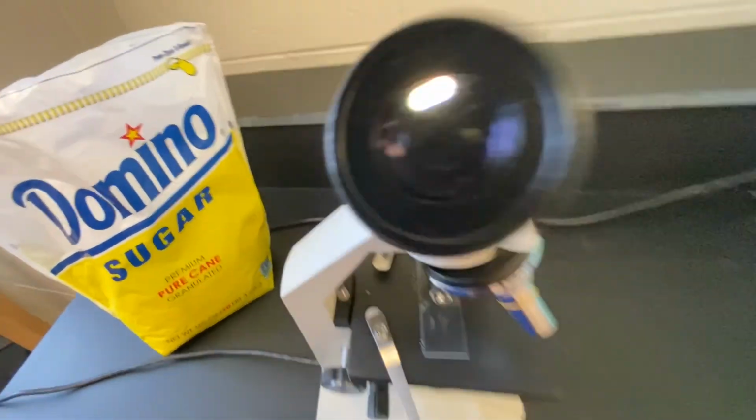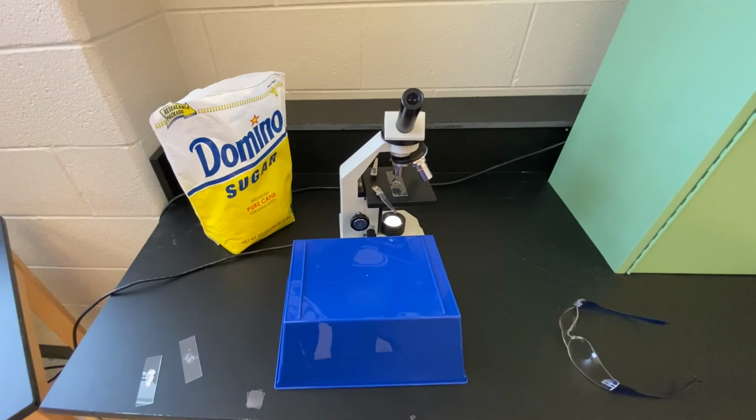So anyway, this is what it looks like after we burned it. This is that black stuff in the test tube. You can see irregular shape, kind of looks glassy, brown. Some light is able to kind of shine through it, maybe it looks like a lighter brown. Some of the thinner pieces, the light kind of comes through a little bit there. So anyway, it gives you a perspective.